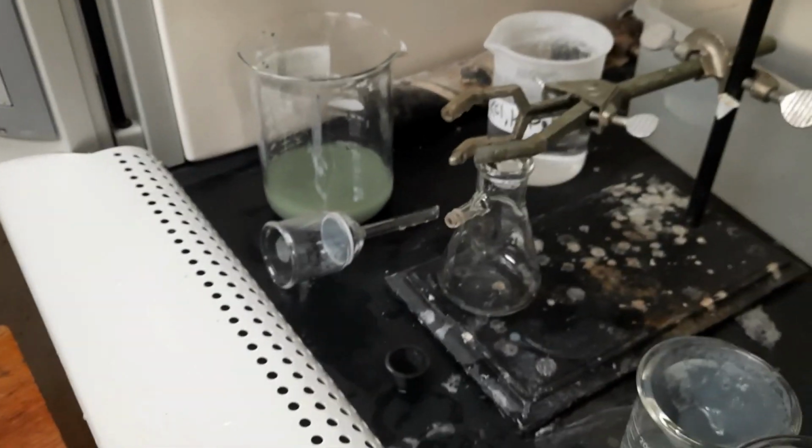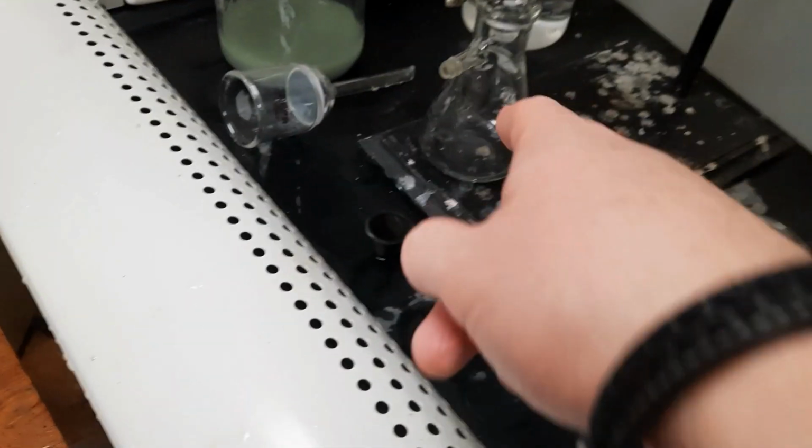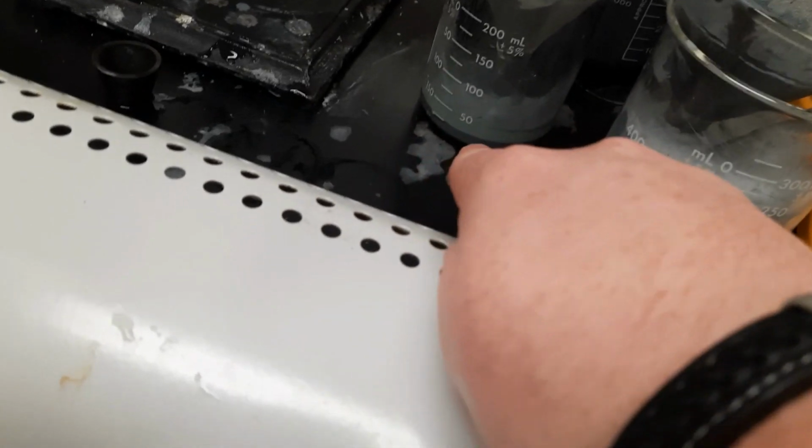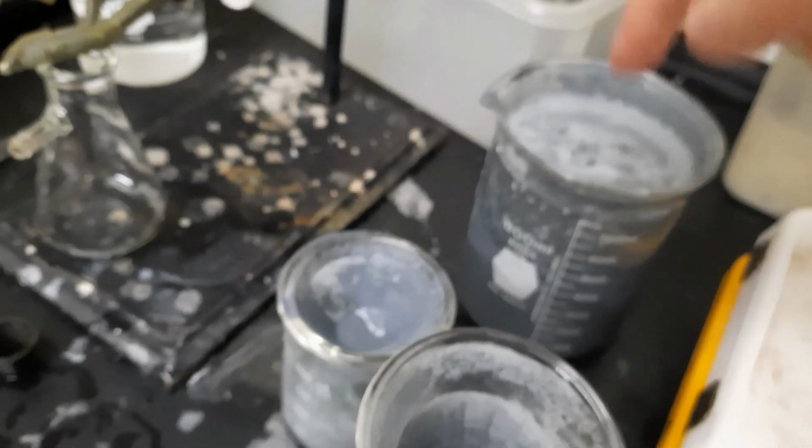It wasn't filtering. I went through like a dozen filter papers, and then I was like, wait, why is the stuff that started yellow, but the stuff not coming through is clear? It was like, and look at that. You see how that's like slightly yellow? There's probably product in there. But look at that. You see how that's like not yellow at all? There's probably no product in there. And that's like the majority of the stuff that's been filtered, but it's only no yellow.